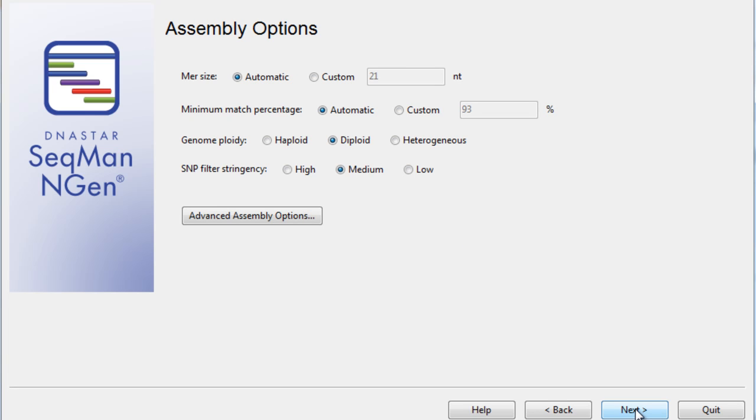Next, our Assembly Options page allows you to adjust any parameters desired. The default parameters are generally fine for most assembly work.